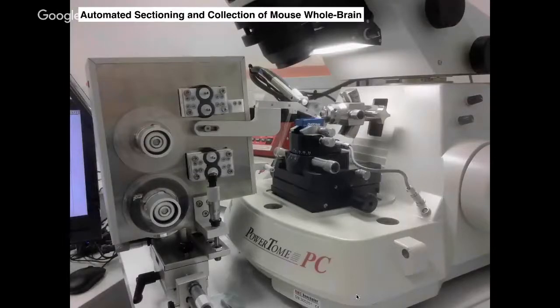So with regard to this, now that we have a brain, we want to be able to cut it up and image it using high throughput EM. There are different ways we can go. I mentioned 3 previously. FIB-SEM is ruled out because of the limited depth that you can actually mill away before problems occur, which is limited to, I think, 100 microns or less.